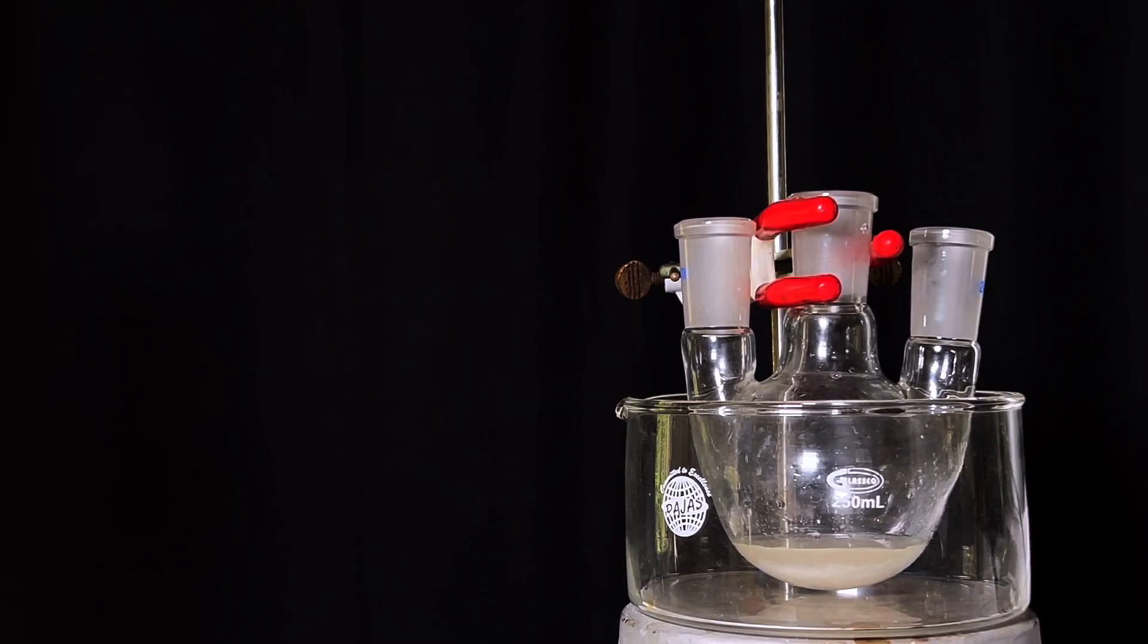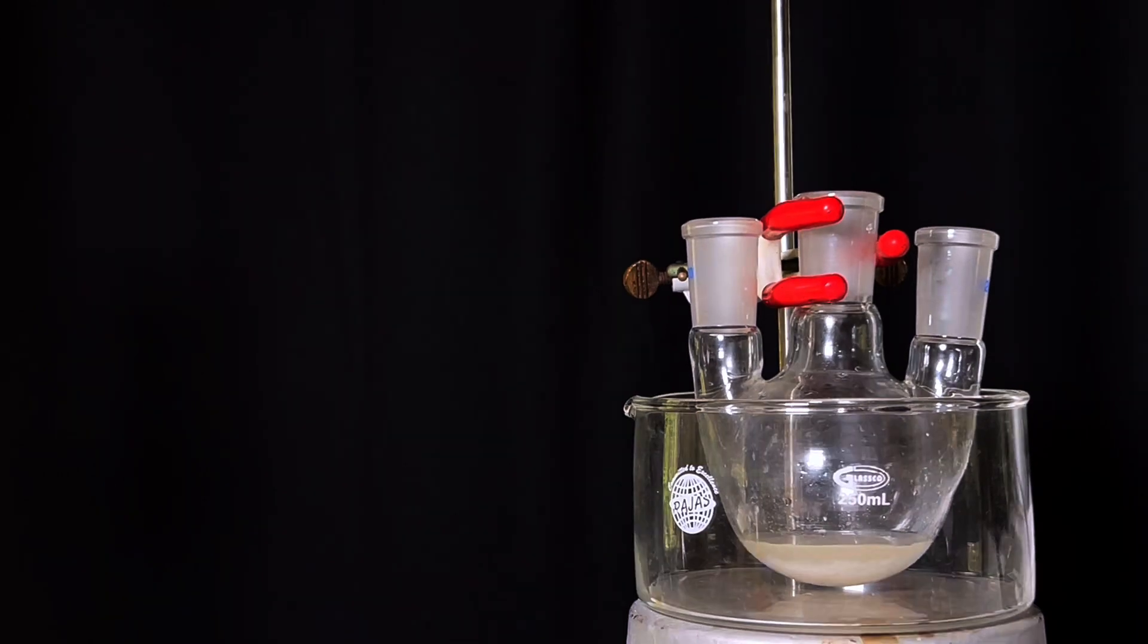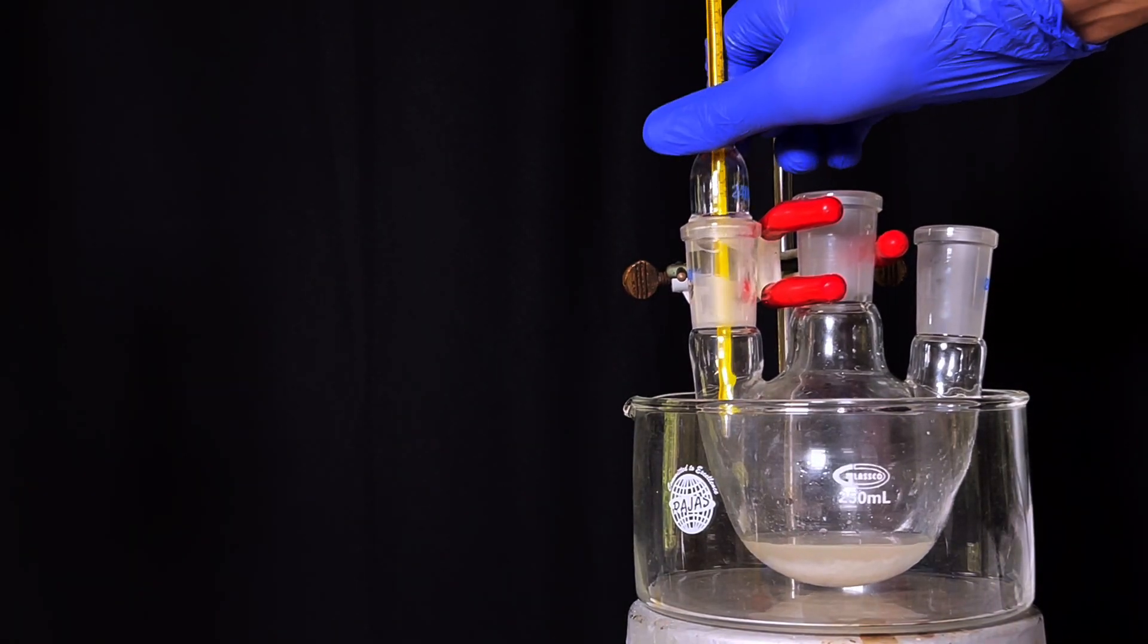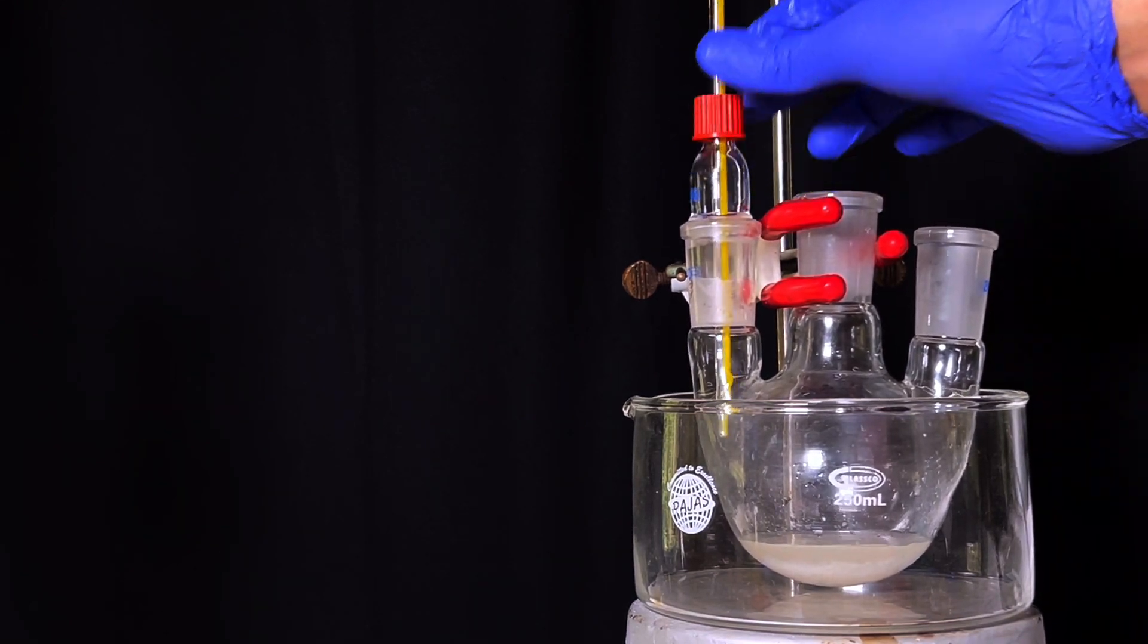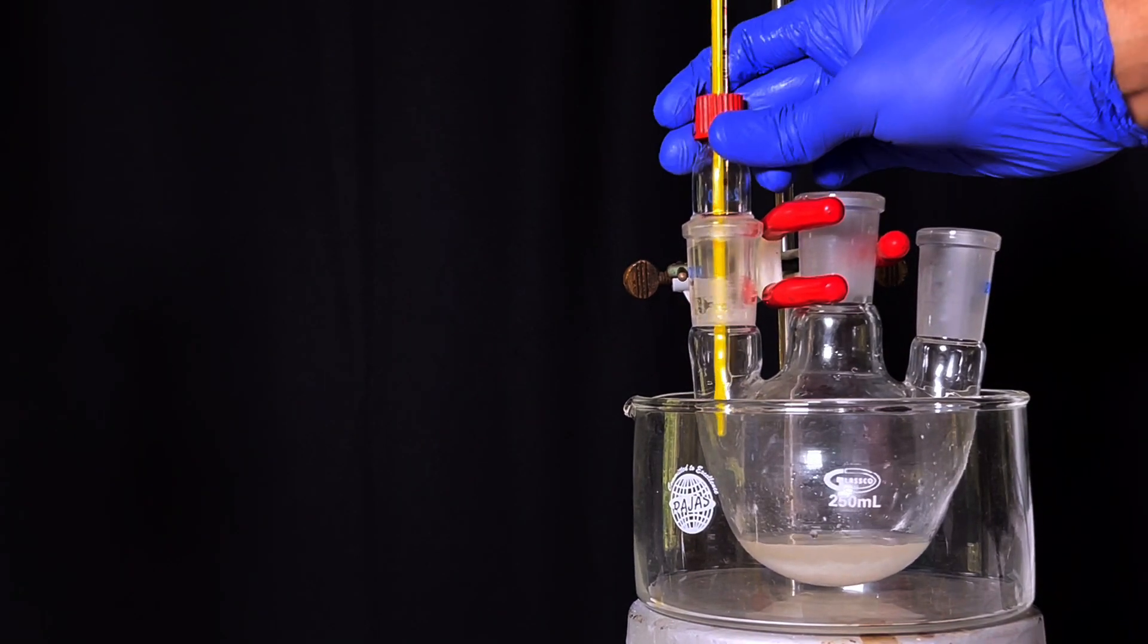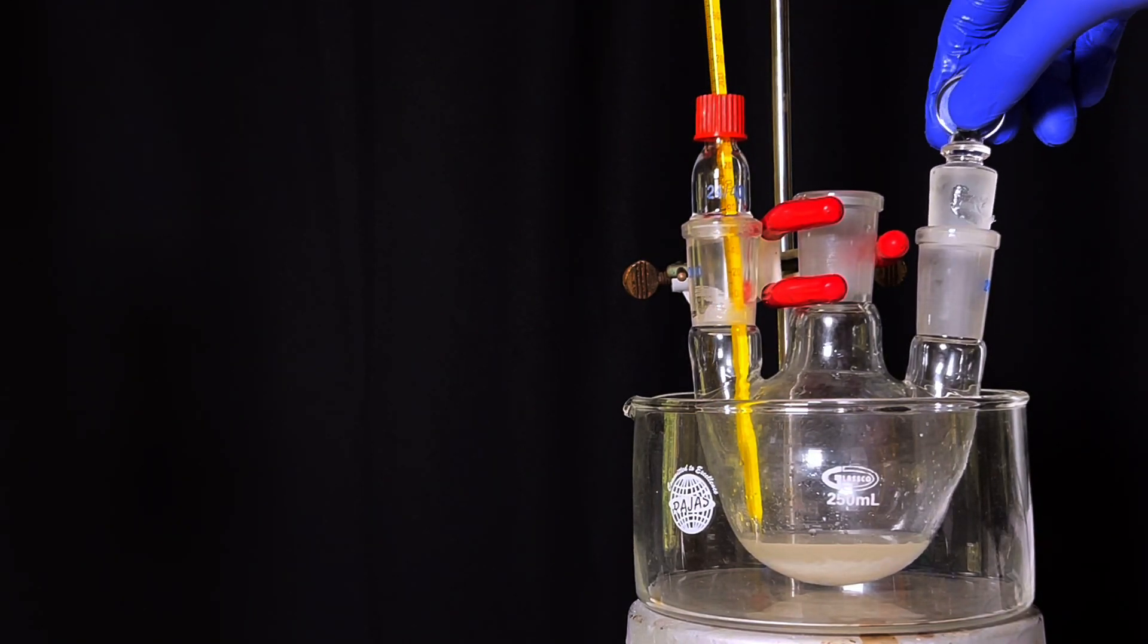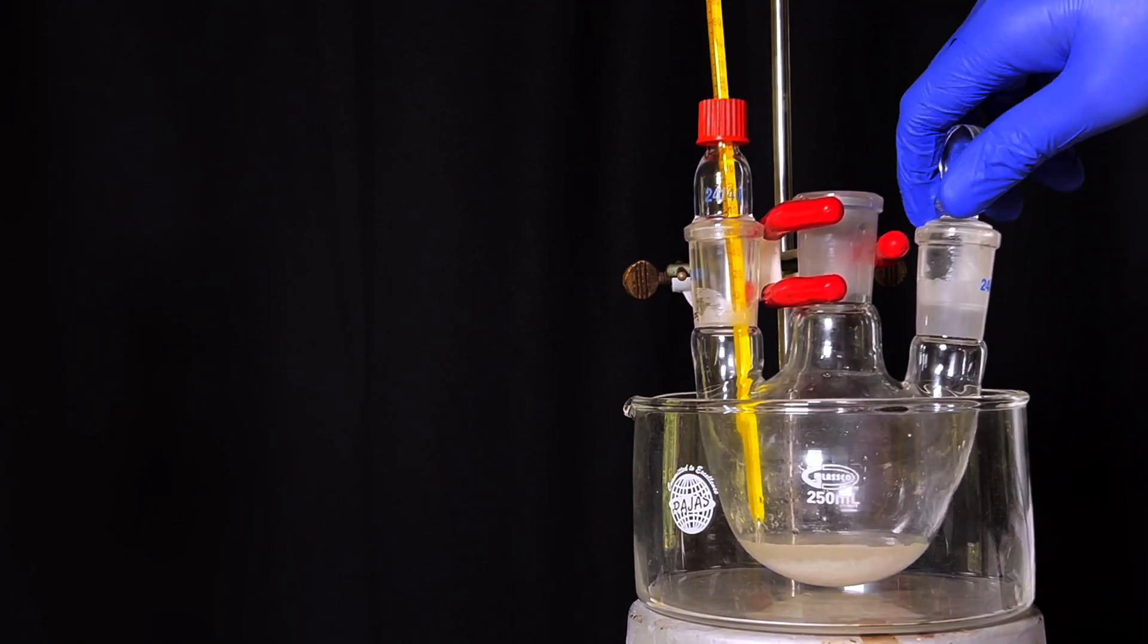The round bottom flask was placed inside a crystallizing dish. A thermometer adapter with a mercury thermometer was placed in one of the side necks. Silicon grease was used to provide an airtight seal. The other side was stoppered with a solid penny head stopper.